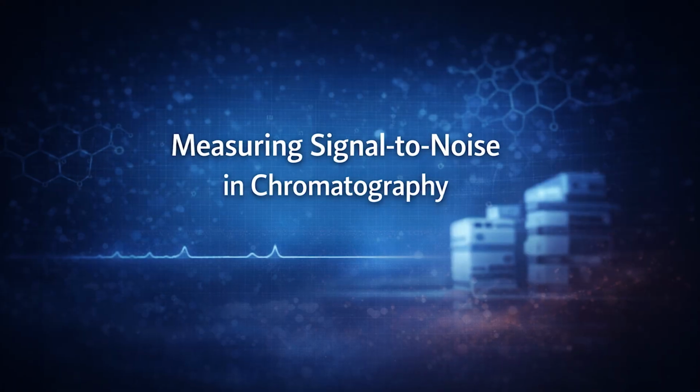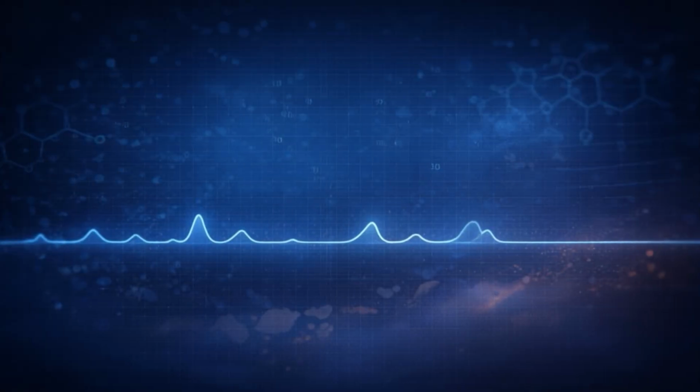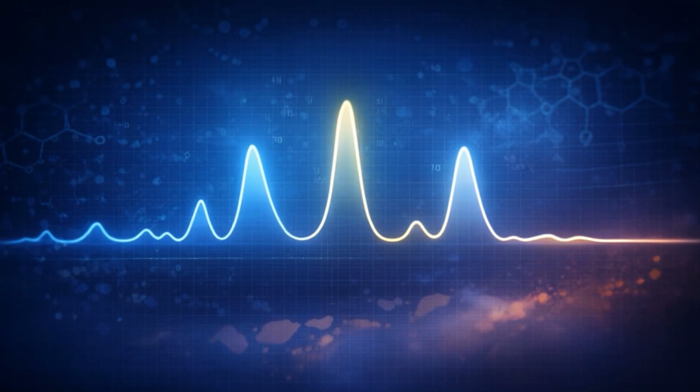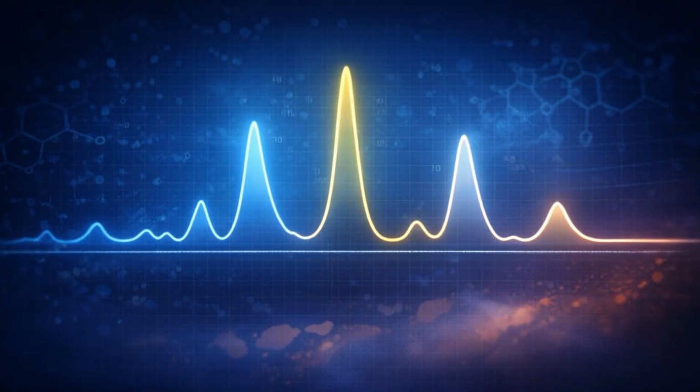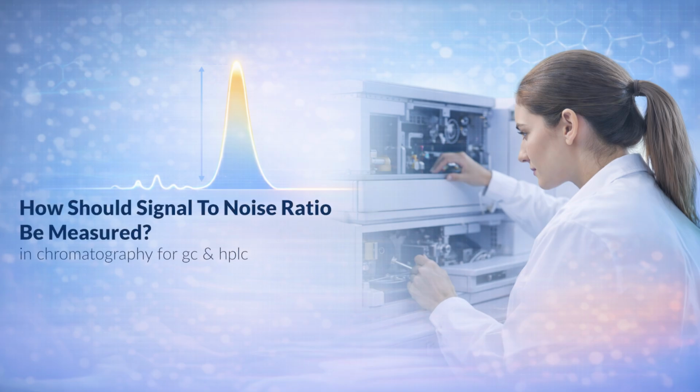How to measure signal-to-noise ratio in chromatography. Signal-to-noise ratio is one of the most commonly referenced metrics in chromatography, particularly in gas chromatography (GC) and liquid chromatography (HPLC). Despite this, it is often misunderstood, especially when chromatographic peaks are quantified by area while baseline noise is reported in detector voltage units. In this video, I'll explain how signal-to-noise ratio should be measured in chromatography, and then show how Chromperfect implements this calculation transparently using formatted reports.